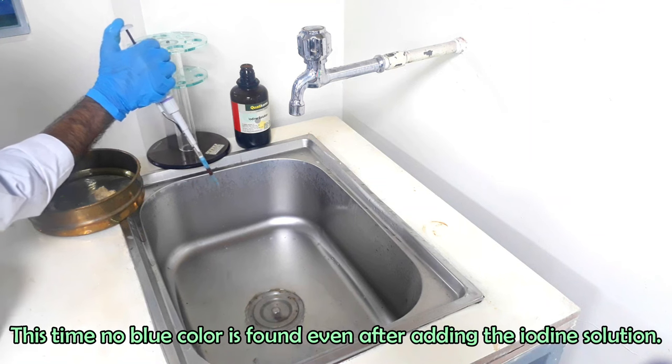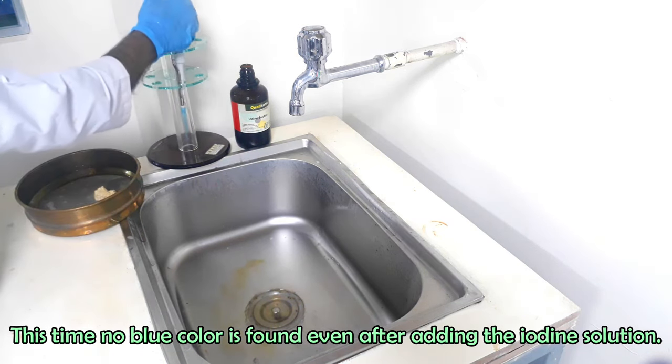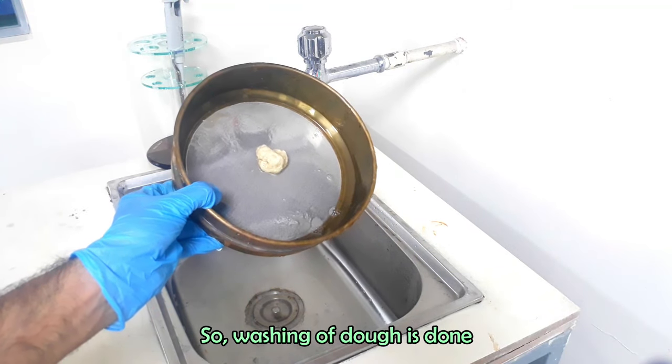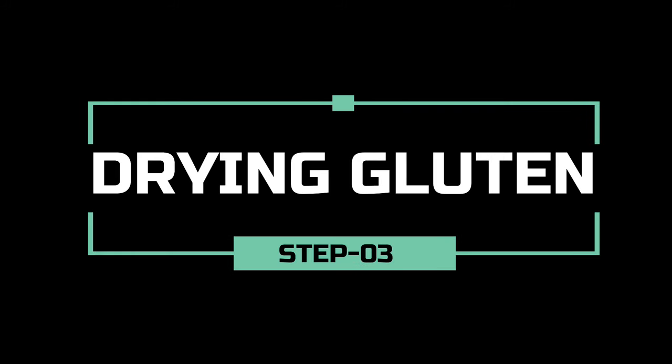This time washings look clear and no blue color is formed even after adding the iodine solution. So washing of dough is done. This is our extracted gluten. Now we need to dry this gluten properly.